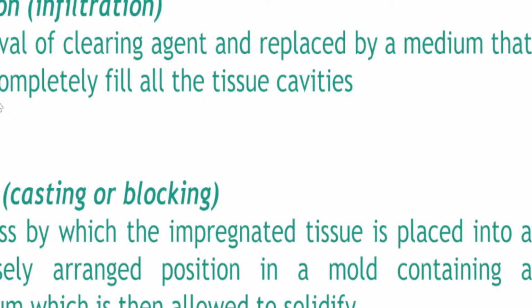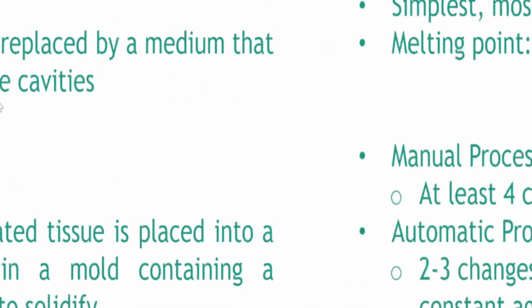Kaya important ang differentiation between impregnation and embedding. Hindi tayo basta-basta naglalagay lang ng sample sa tissue block or sa blocking station ng hindi ino-orient doon sa precise orders, sa precise location or position ng pathologist. Okay? Okay. So baka tanungin kayo about that.